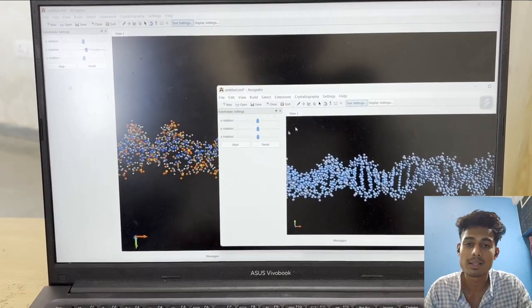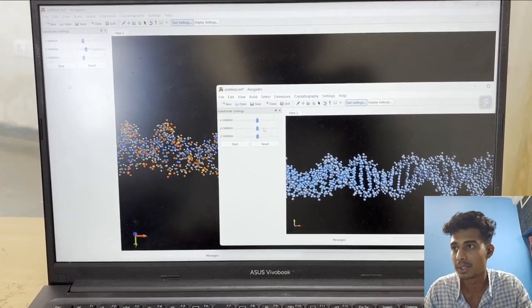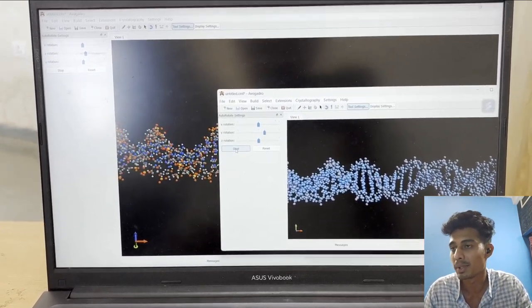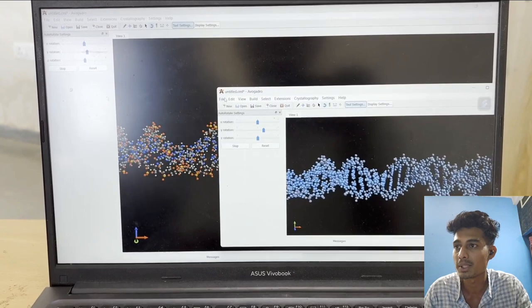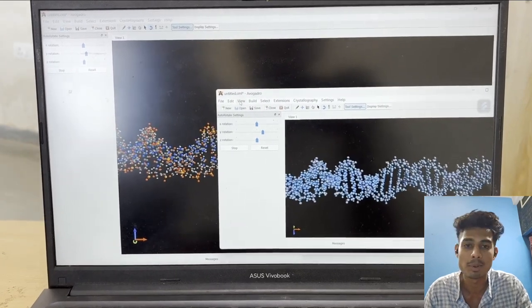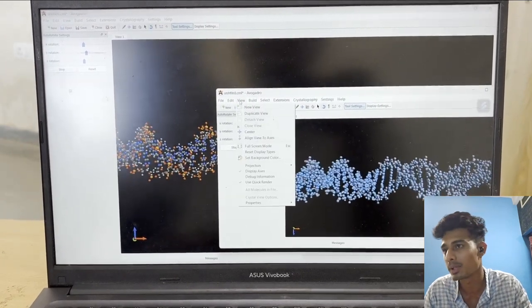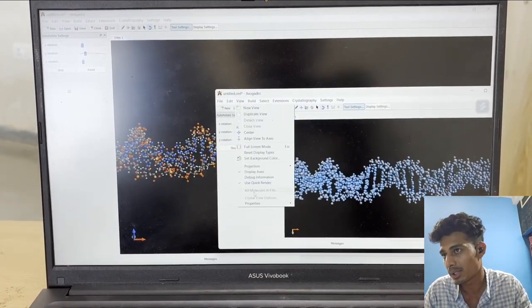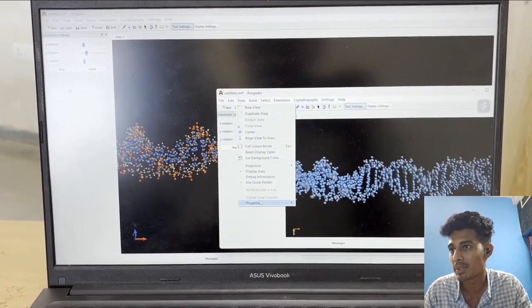On the other hand, when we go to View, we need to see some properties like molecular properties, item properties, and properties.